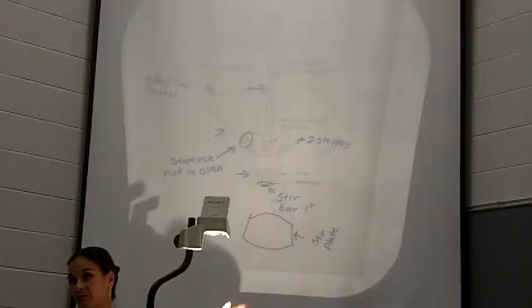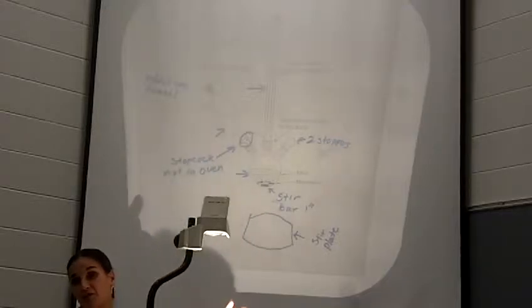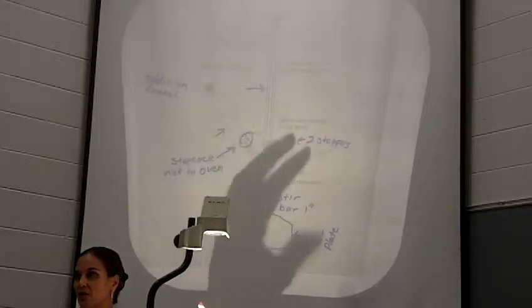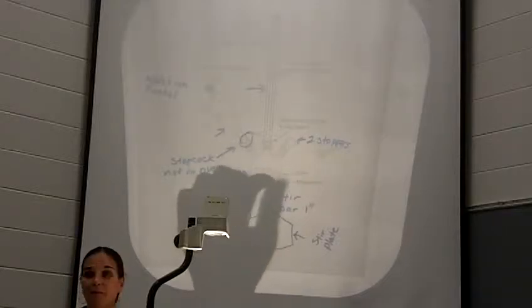It's a metal, right? So kind of shiny like a metal. It's silver. I'm asking just because there's magnesium and magnesium sulfate by the balances, so you've got to make sure you grab the right one, okay? So grab the shiny metal, that's the magnesium, okay?